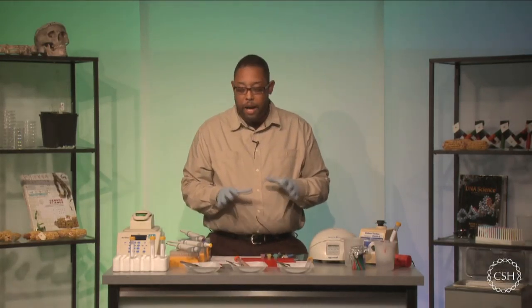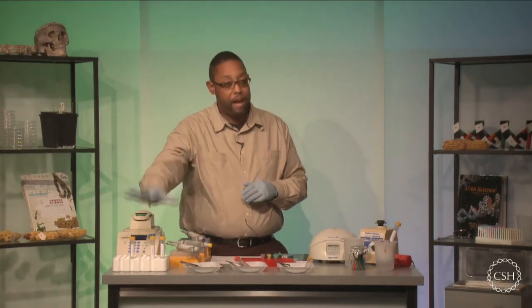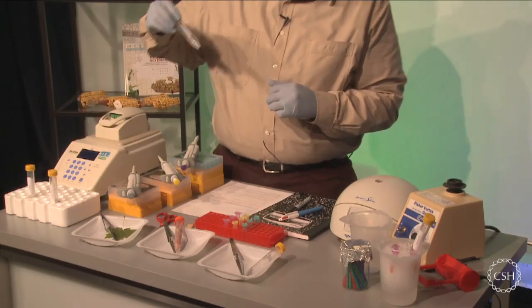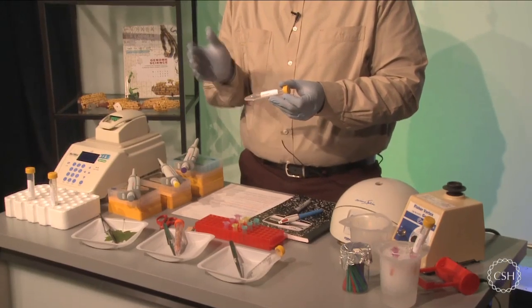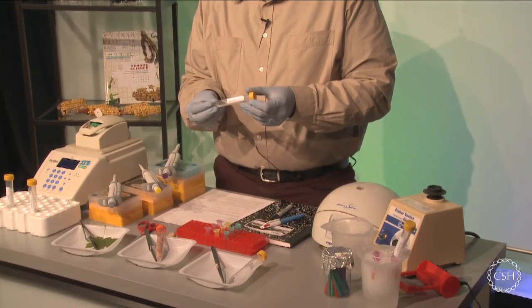Okay, now let's get to the immediate things that we need. We're going to need some reagents. So I have a set of reagents over here that I'm physically going to need. This is going to comprise of lysis solution. So I have my lysis solution, which is actually going to allow me to help break up the membrane and release the contents of my physical DNA. Okay.